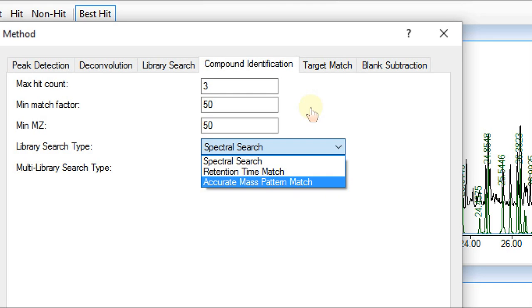So multiple spectra are stored, and the searching algorithm will examine each one of those and report back the best to cover the case where you might have an adduct formed in electrospray that's stronger than the original molecular ion. But the main point is, if you have multiple spectra for a particular hit, this will return the best score within that set.